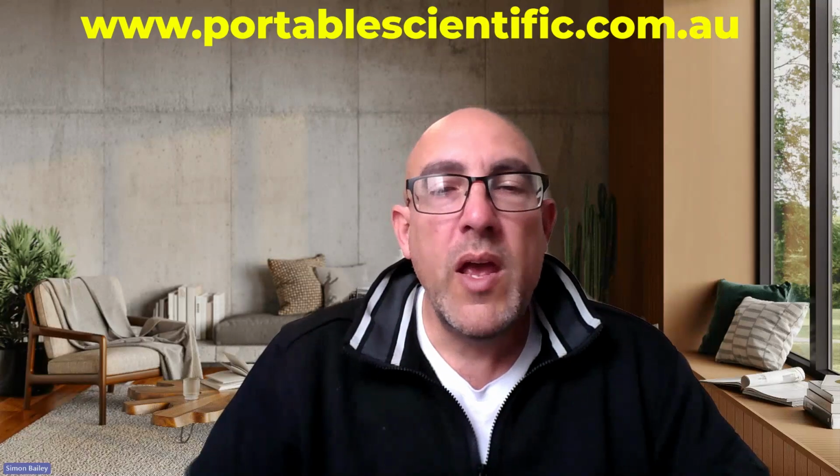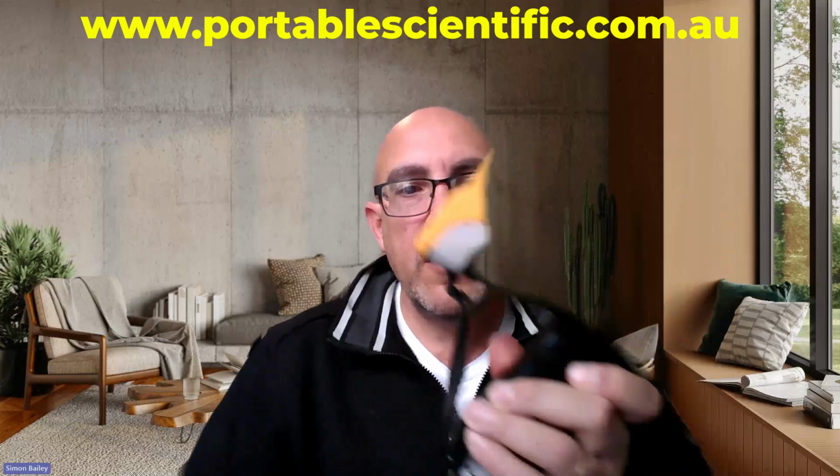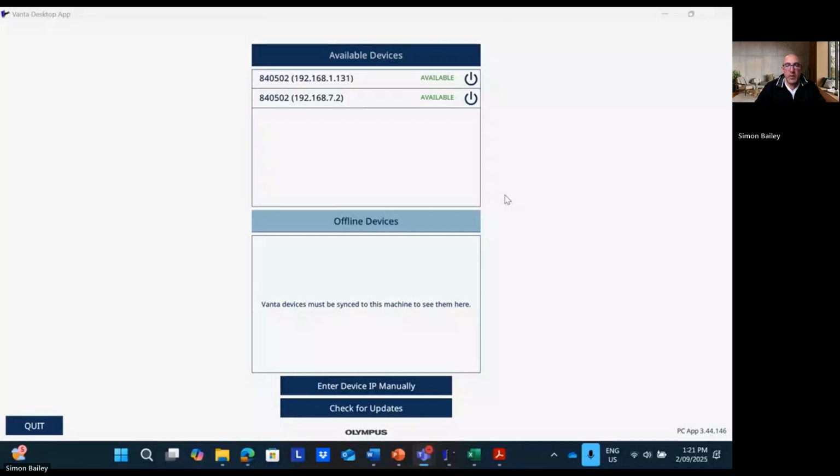Today I'm going to be showing you how to create notes and export templates on your Vanta Generation 1 XRF. The first thing you will need is the Vanta desktop software. I'm sharing my screen with you. I've already gone ahead and installed the Vanta desktop software. If you don't have access to the Vanta software, please contact myself, and my email address is at the start and at the end of this video.